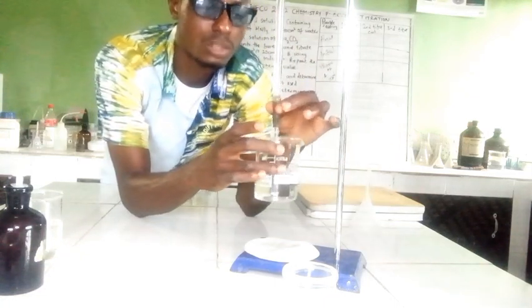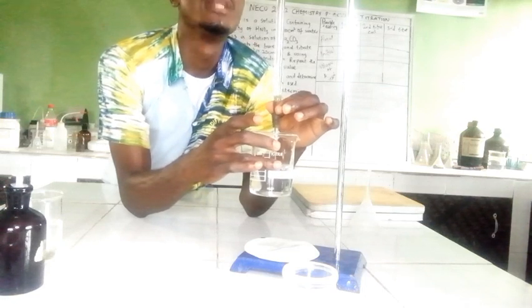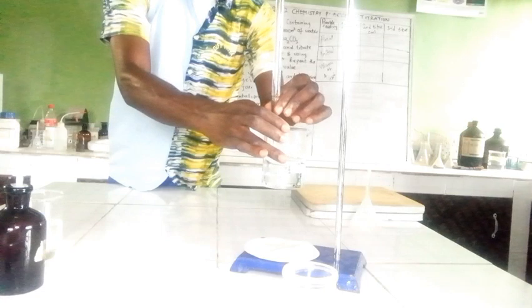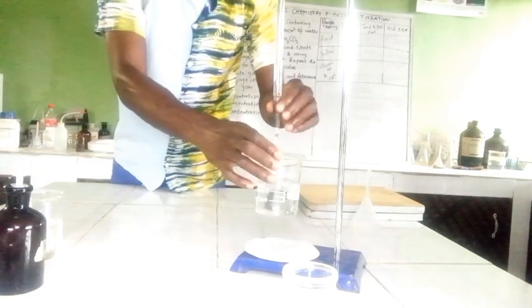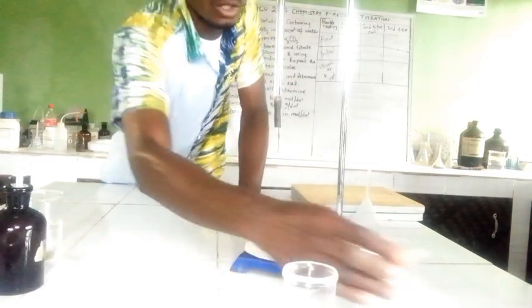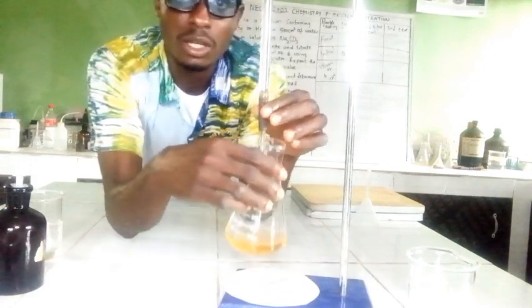So I remove my funnel and then adjust the solution to zero. Okay, good. All right, good. It's right there on zero. So now we can start the experiment. So let's keep titrating now and see the response.